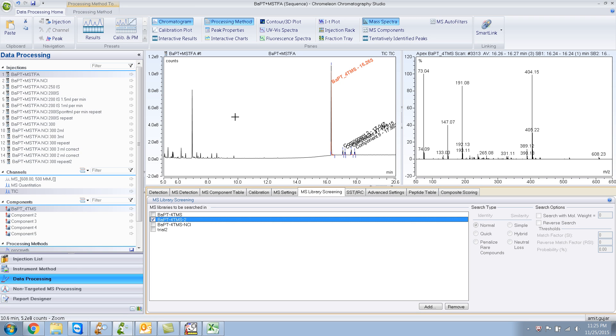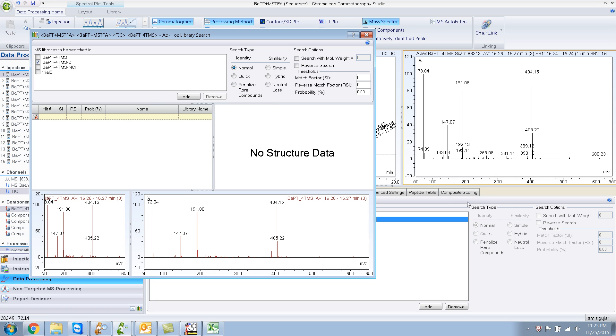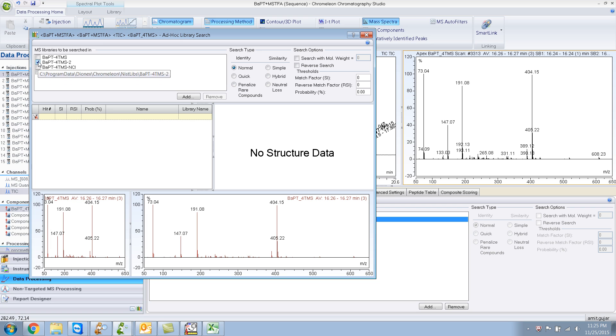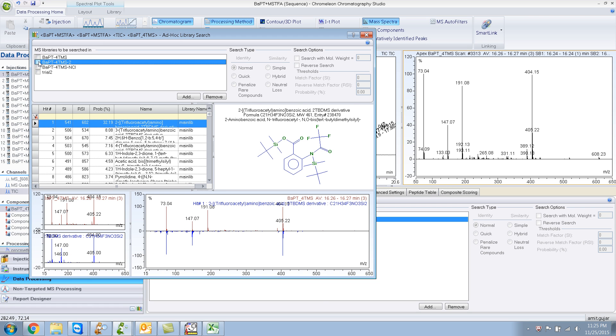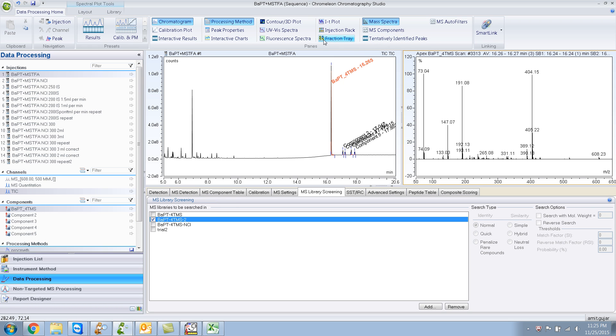So, as soon as I right click and find a library, nothing shows up. Let me see what's going on. Let me do this again. Nothing shows up. Let's try it this way.